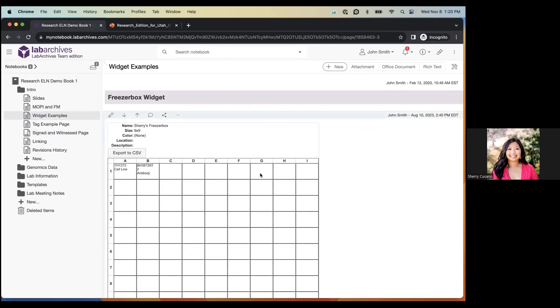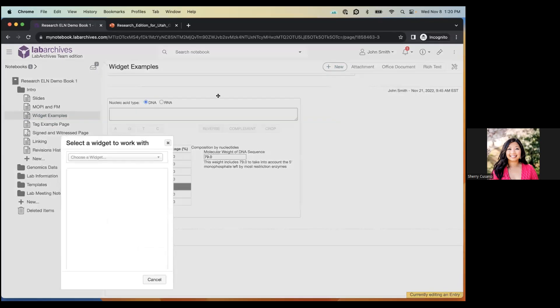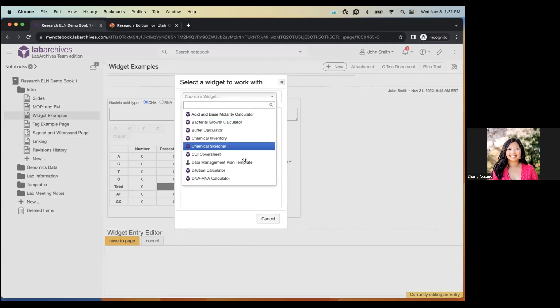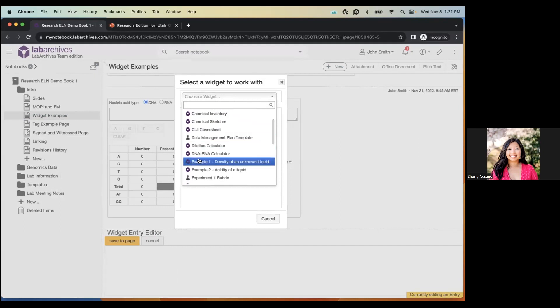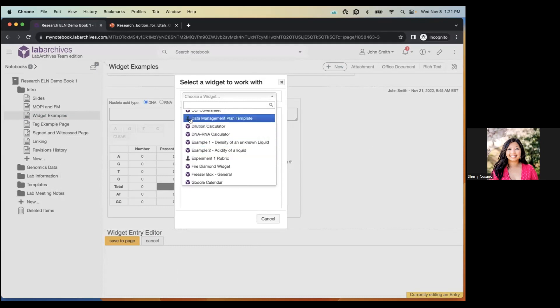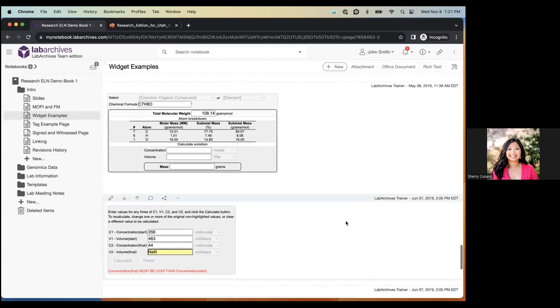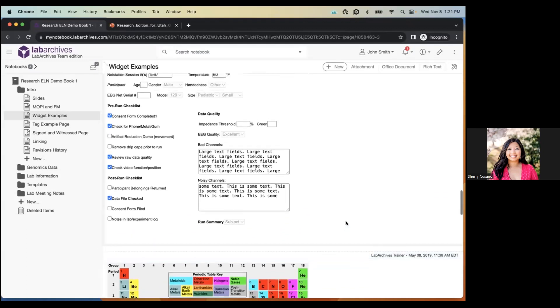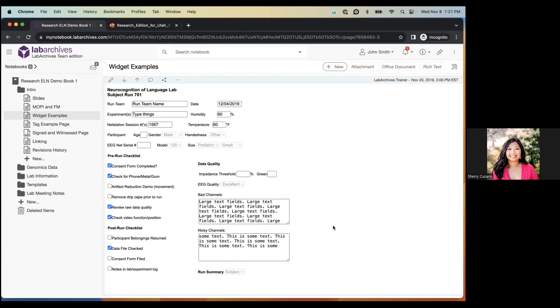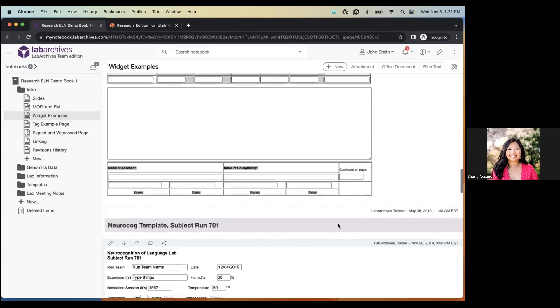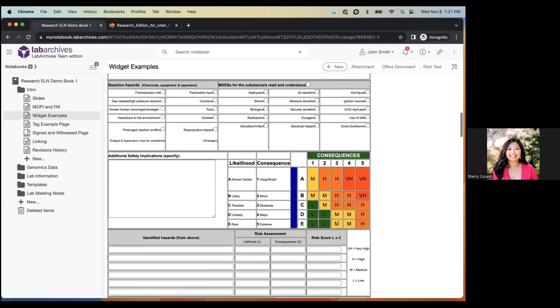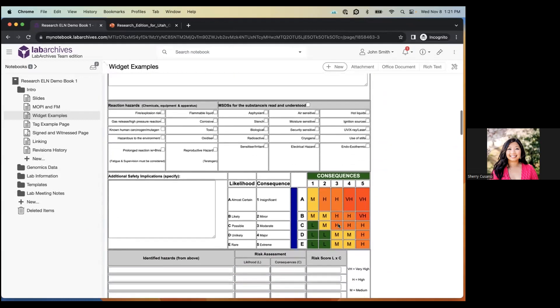Widgets are customizable, interactive HTML forms or applications. We have built-in widgets ready to use — access them via Plus New, then 'Widget.' Anything with the Lab Archives icon is a built-in widget. You can also create custom widgets, which will be available in any notebooks you own. You might want a form with text boxes, checkboxes, dropdown menus, or radio buttons — you can create a widget with all of these features. We have a whole knowledge base section on creating widgets.